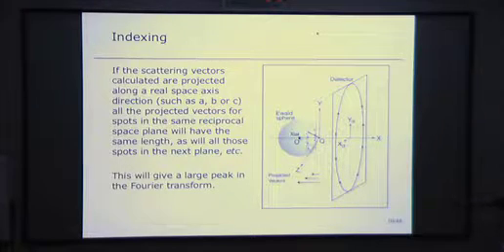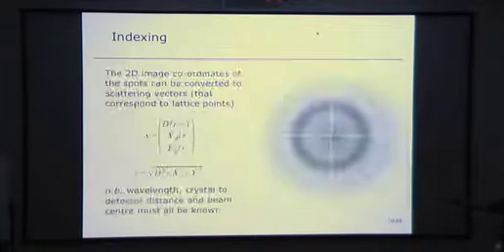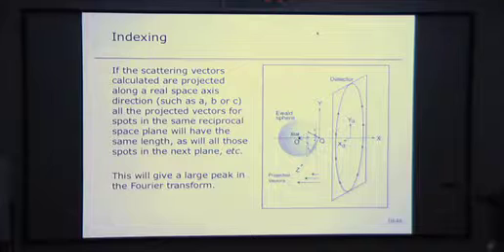imagine you have a detector over here that has 8 diffraction spots appearing on it. We can project those back onto the Ewald sphere, and as we know, when a reciprocal lattice point is on the Ewald sphere, you get diffraction. What we're going from here is from the diffraction pattern to the reciprocal lattice impinging on the Ewald sphere.